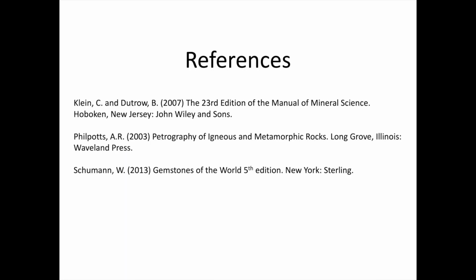Here are the references I've consulted in constructing this video. You should also note that there's a whole bunch more depth to optics than we're getting into here. We're kind of trying to keep things at the level where we can understand light in order to identify minerals. But there's a whole bunch more to learn.